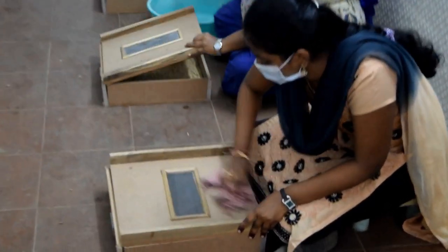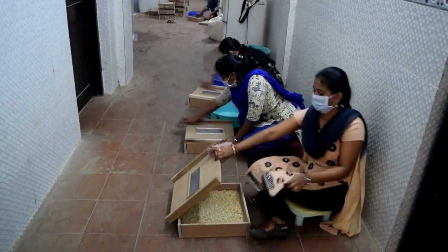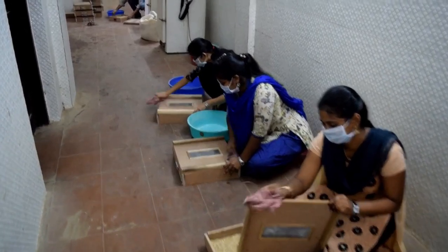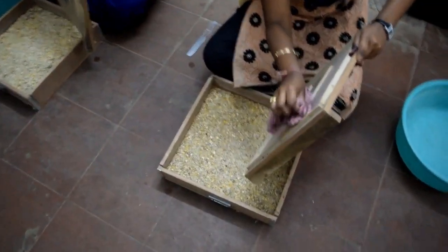The rice moth rearing boxes, which have been used for 100 days, are being cleaned for reuse. Then, the remnant in the used boxes is disposed of.